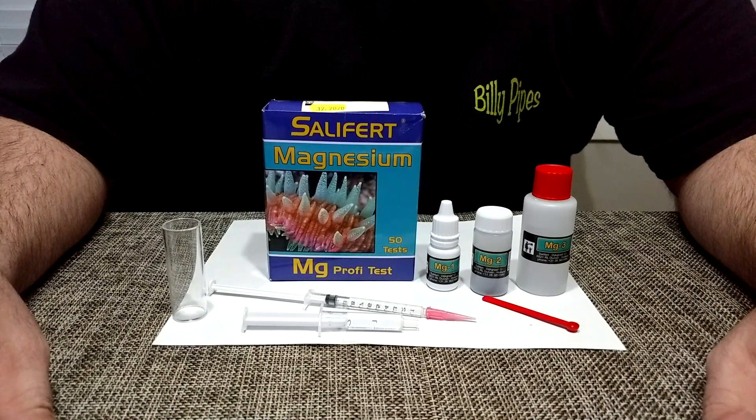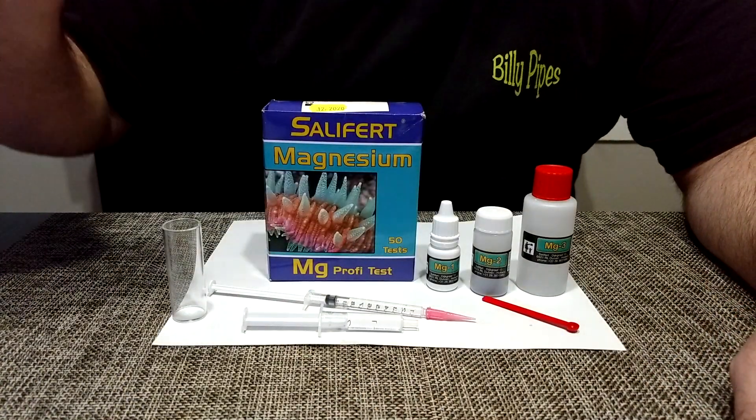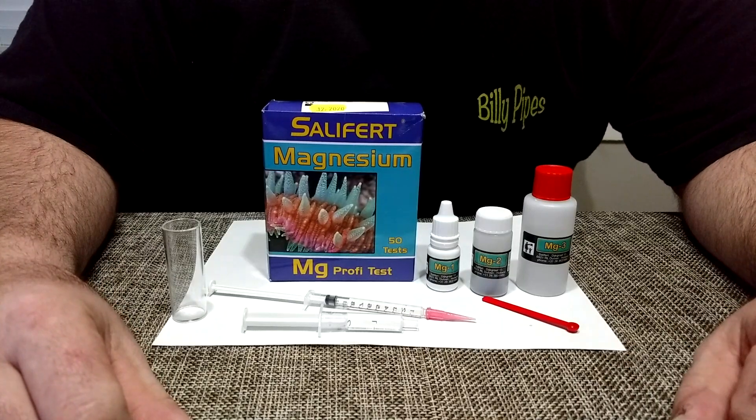Today we're going to be going over the Salifert Magnesium Test Kit. It does come with instructions, but I know it by heart, so we're just going to get right to it.